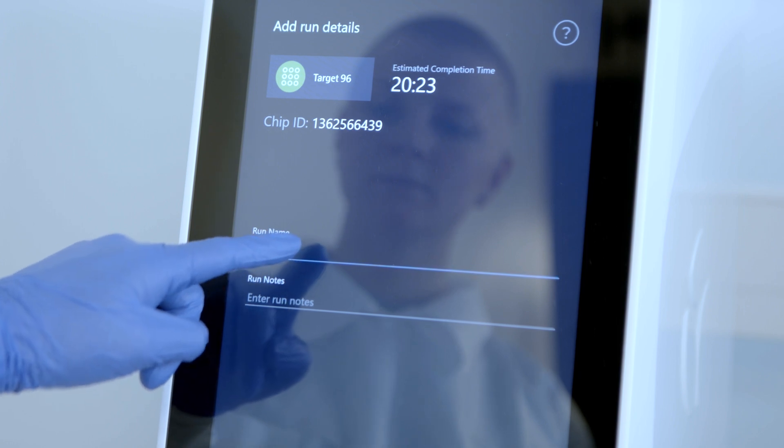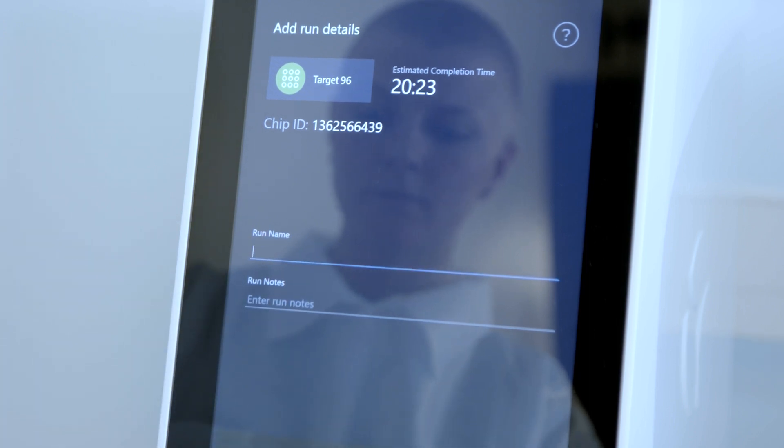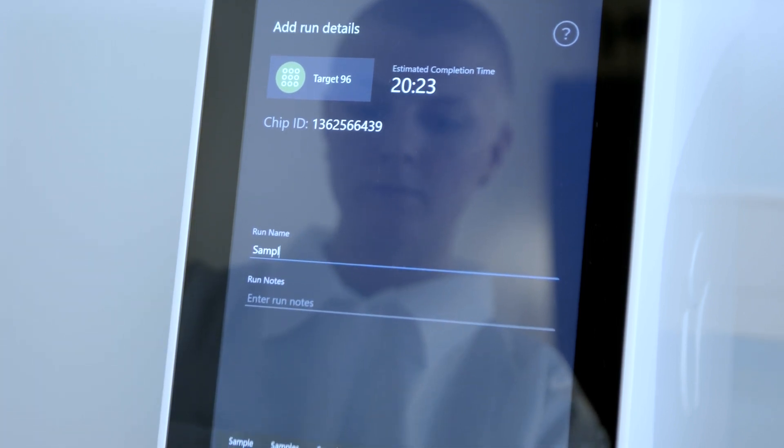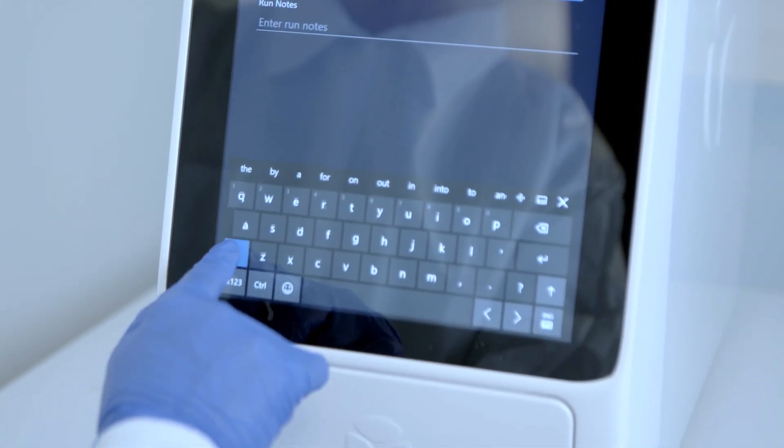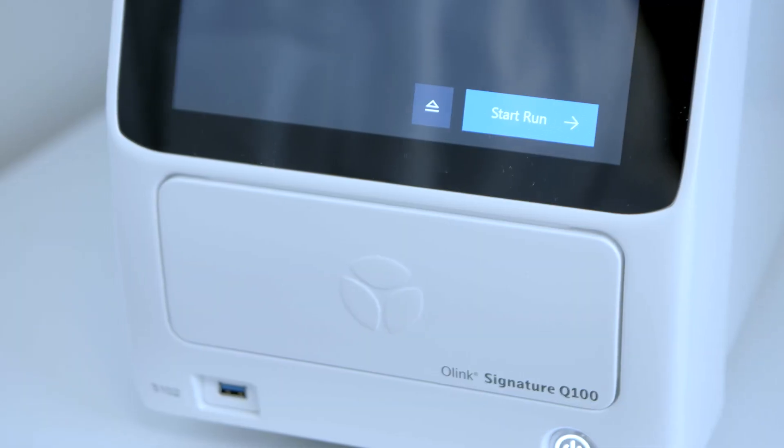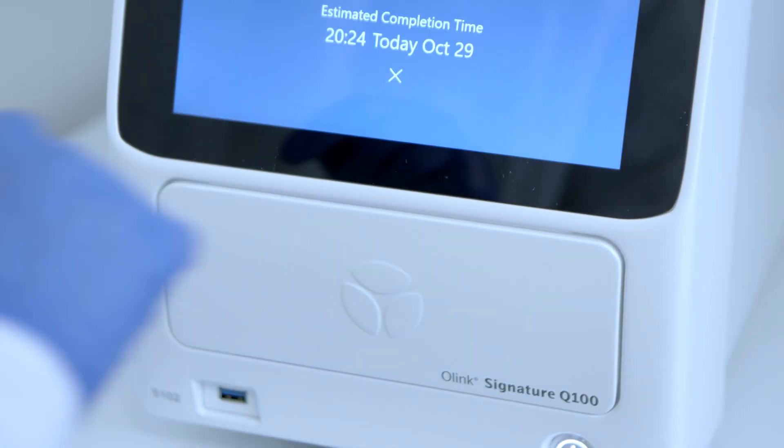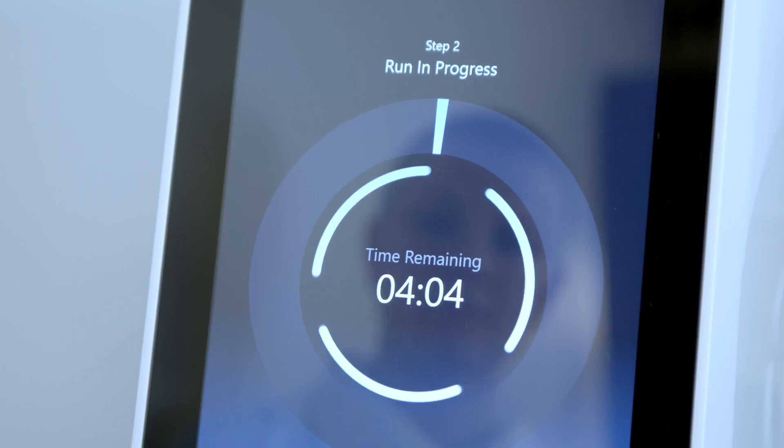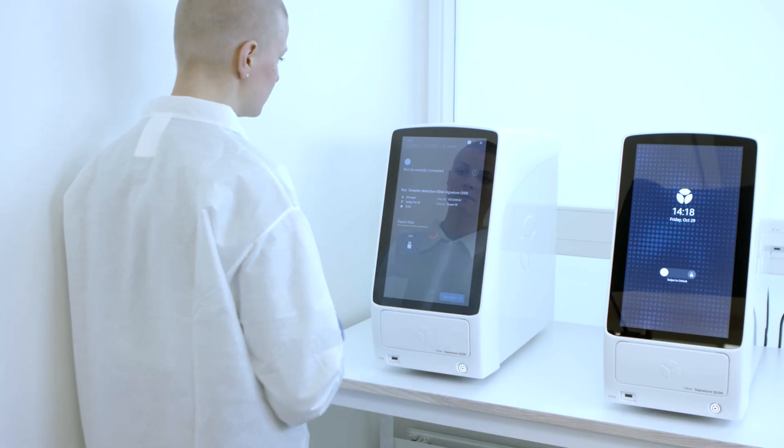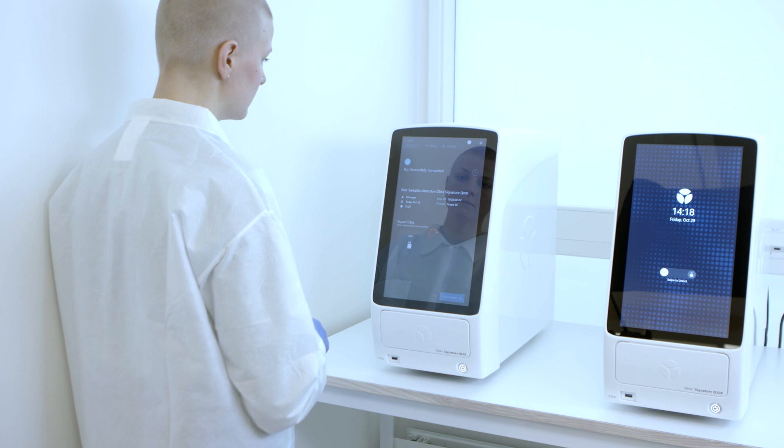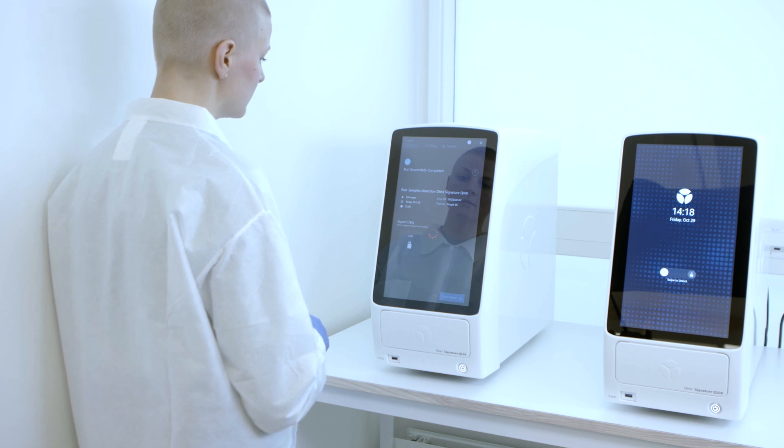On the Add Run Details screen, confirm the chip ID. Then enter a custom run name or run notes if desired, and select the panel type. Tap Start Run. The run begins, and the screen displays the time remaining. Tap Finish when the run is completed. Now you can analyze the exported data using the NPX Signature software.